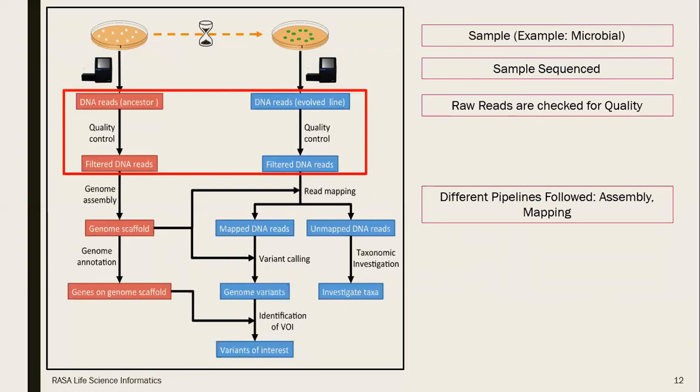Aligning of your reads to the reference genome or the reference transcriptome. It is a good idea to check again the mapping quality, as some of the biases in the data would show after the mapping step. Now variant analysis is performed, including variant calling or predicting the effects of the identified variants on known genes. Example, amino acid change or frame shifts or deletions, whatever.